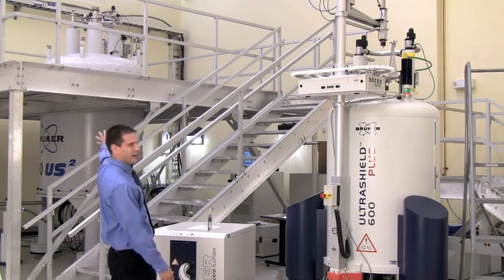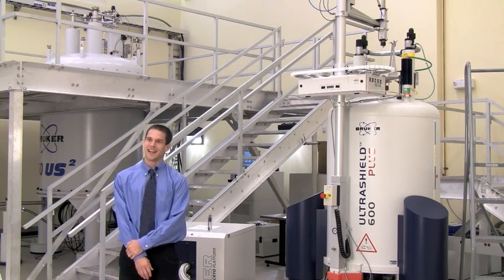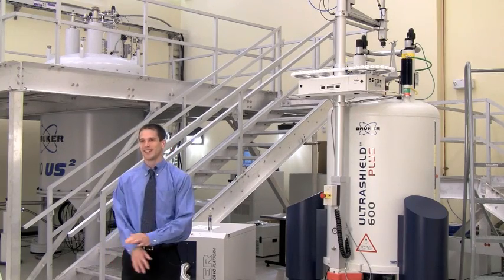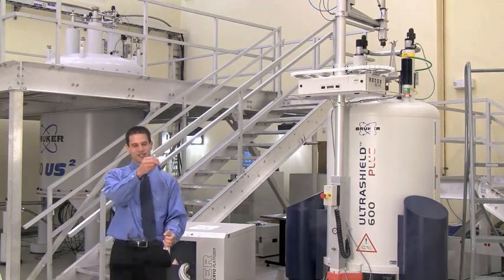This one, and the one behind me, which is one of the largest in the world for its kind. Essentially, instead of putting a human into an MRI, we put a small sample very similar to this, which is just half a milliliter of sample.